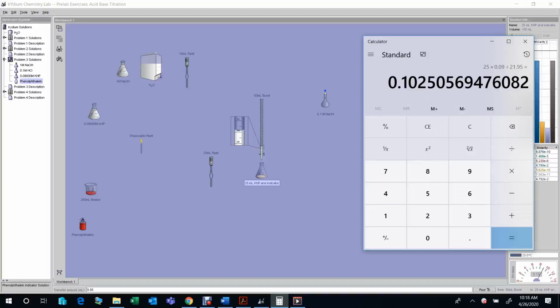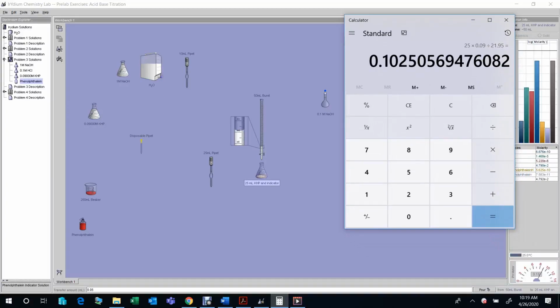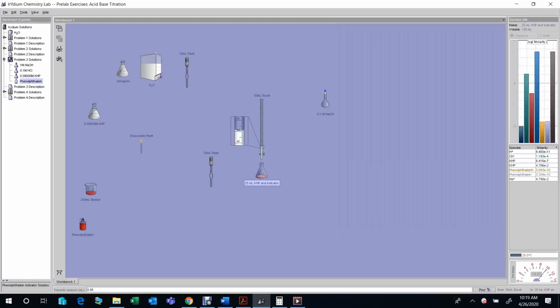This is after being diluted 10 times, and we need to record this to titrate hydrogen chloride acid. If you're not sure, here it's very obvious there's some color change. And if we add another 0.05, you can see the color becomes even darker. If we reach this point, that means we overshoot, and we don't want to do that.